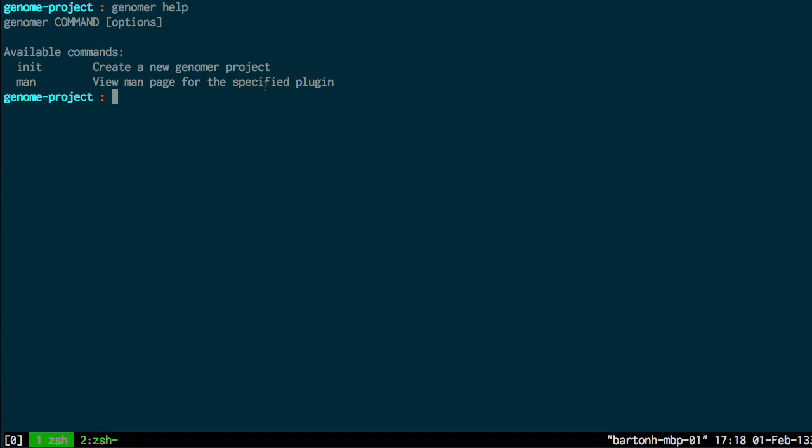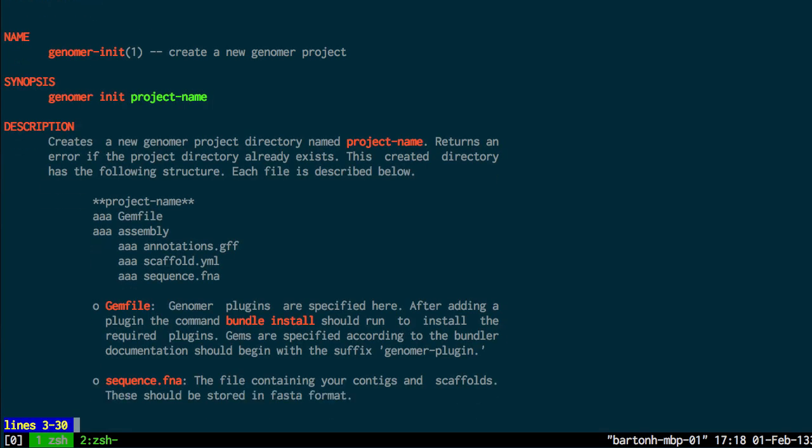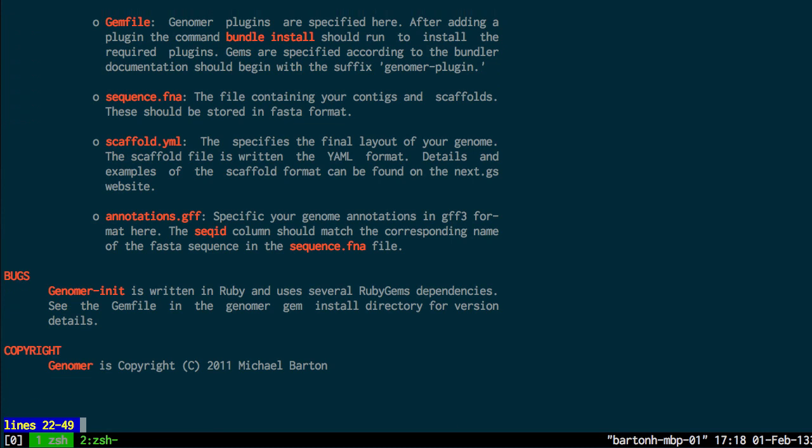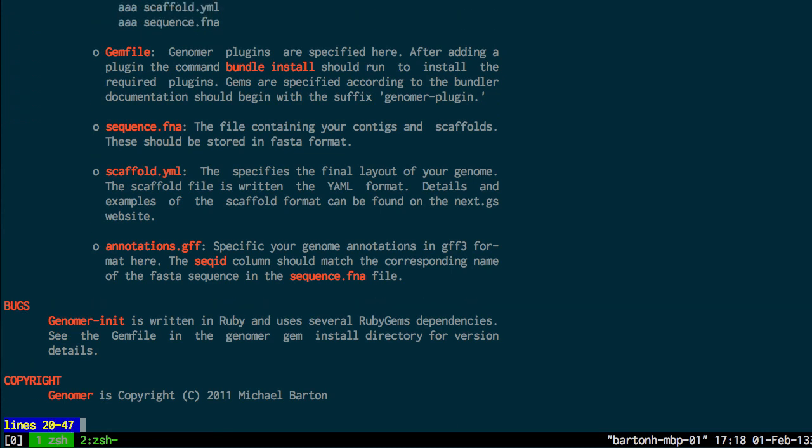So an example of using the man command. I'll do Genoma man init and that gives the man page for the init command I just ran and it has listings for the files there.